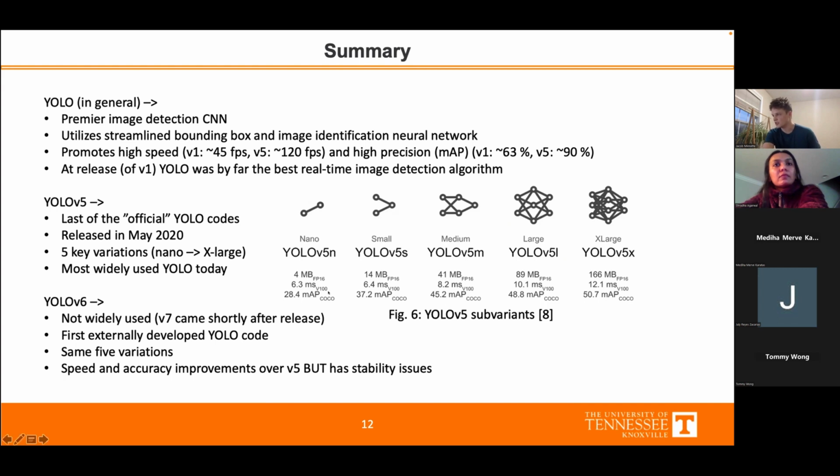So it's actually the number of total convolutions that are done within each of the CNNs, which is represented by the actual data size. So this is the data size of the actual program, not of its training or input data set. As you streamline and remove a layer, moving right to left, it would improve your code's efficiency or speed rather, which is represented by the time it takes to compute the outputs. But you're going to be sacrificing your accuracy. So relating that to what we were just talking about, I imagine that means it's less in that top big box and more in that bottom small box.